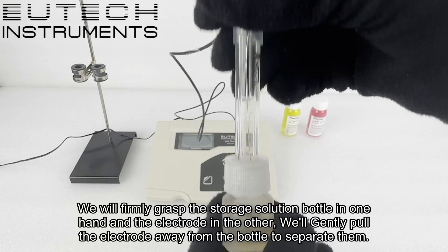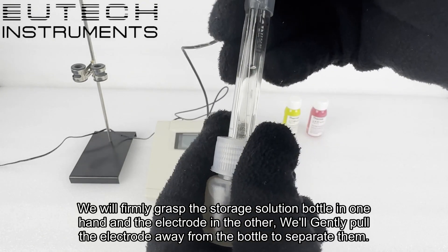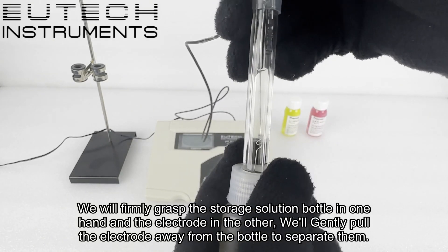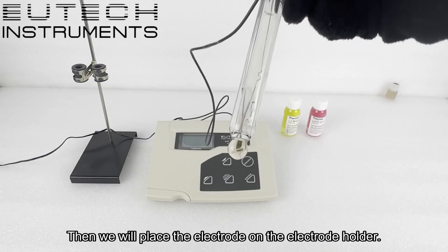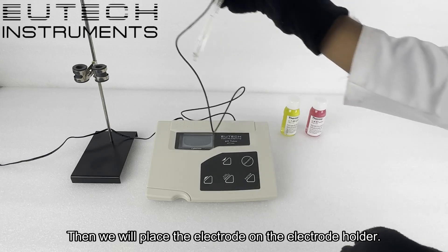We will firmly grasp the storage solution bottle in one hand and the electrode in the other. We will gently pull the electrode away from the bottle to separate them, then we will place the electrode on the electrode holder.